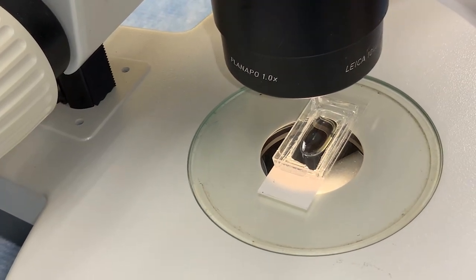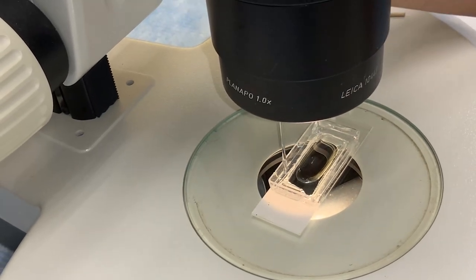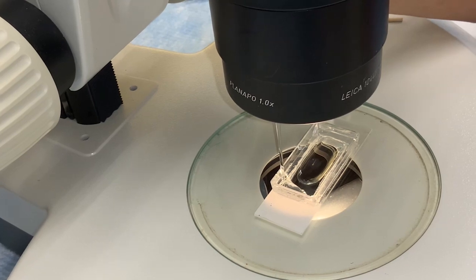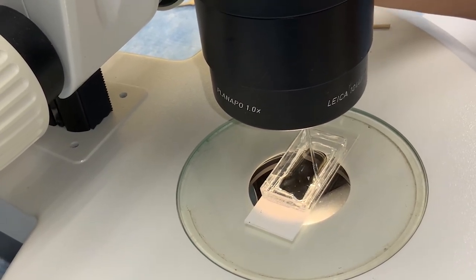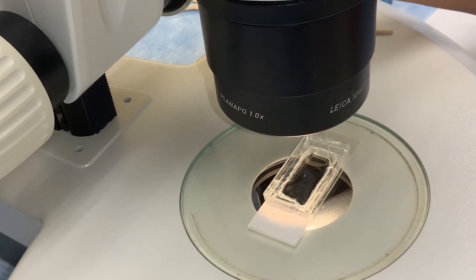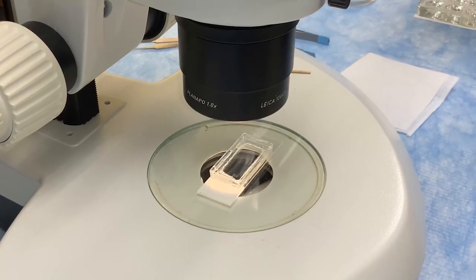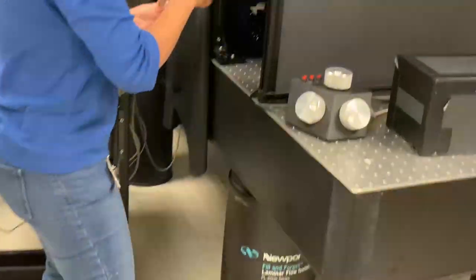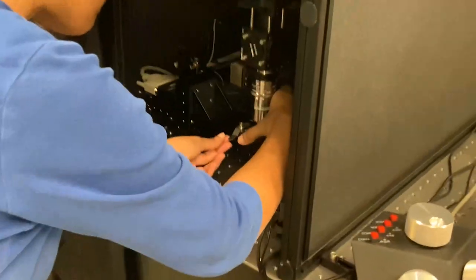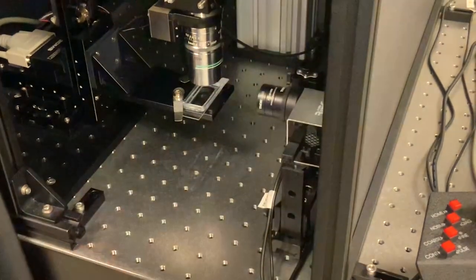Zebrafish embryos and larvae can be maintained in agarose in this way for several hours. They can be removed from the agarose after imaging and allowed to develop further. This enables the same fish to be imaged on multiple days. Once prepared, the imaging chamber with the immobilized larva can be placed on the stage of an upright, custom-built 2-photon microscope, which we use in conjunction with water immersion objective lenses.